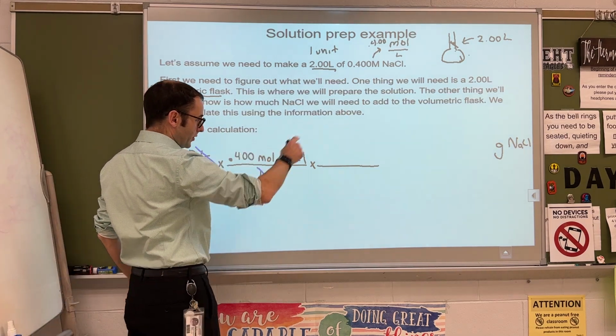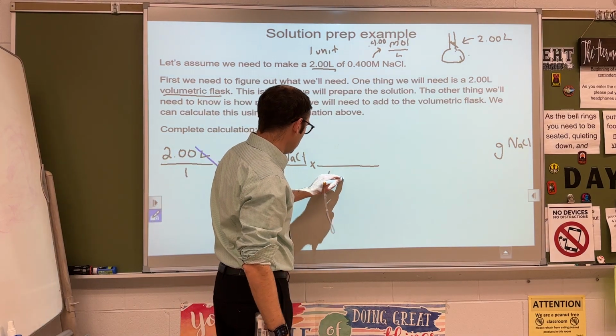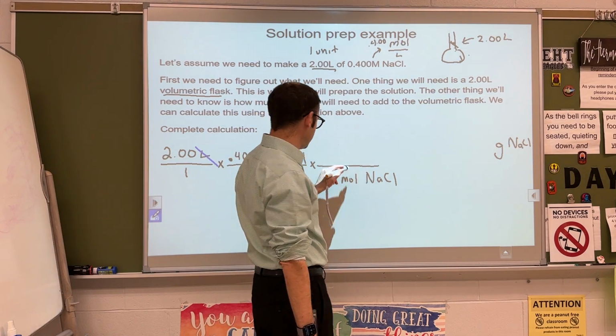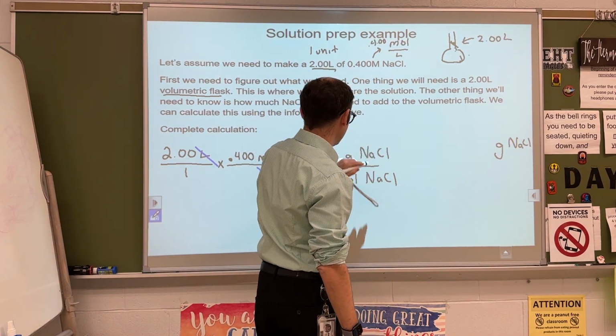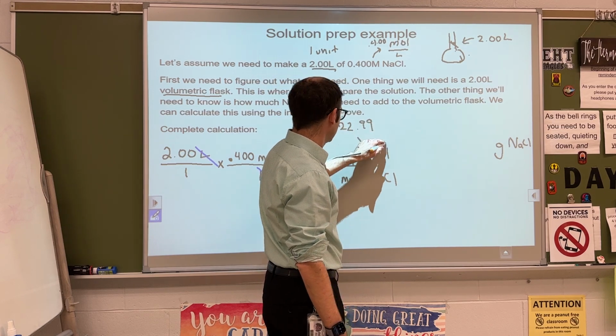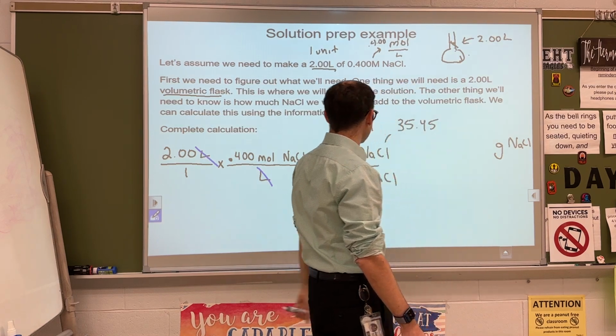We don't want moles, we want grams. So you guys know what to do. We would put moles on the bottom. So 1 mole of NaCl equals how many grams? Yeah, we need to look on the periodic table, right? So sodium's what, 22.99? Chlorine's 35.45.